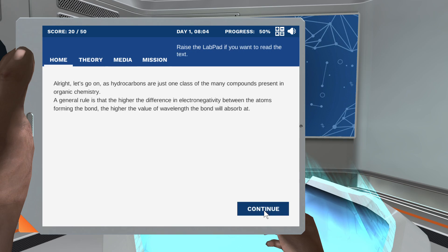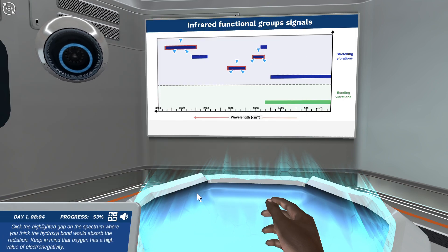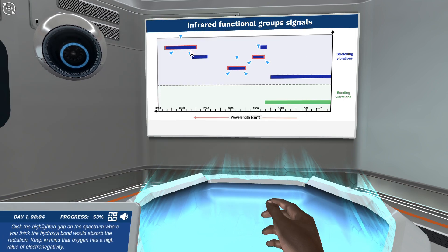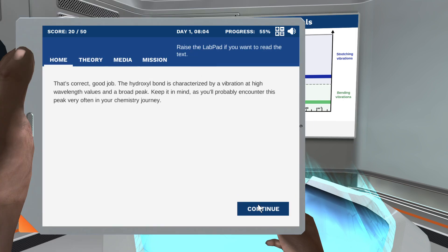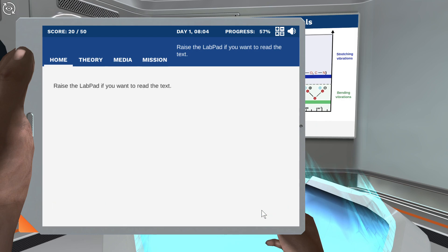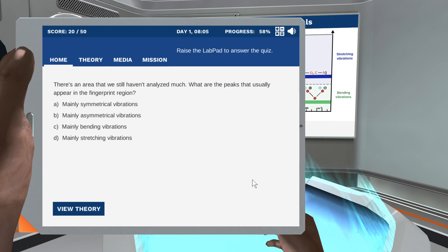All right, let's go on. Click the highlighted gap on the spectrum where you think the high is — that's correct, good job! As promised, here's the complete view. There's an area we still haven't covered — what are the peaks that usually appear in the fingerprint region?